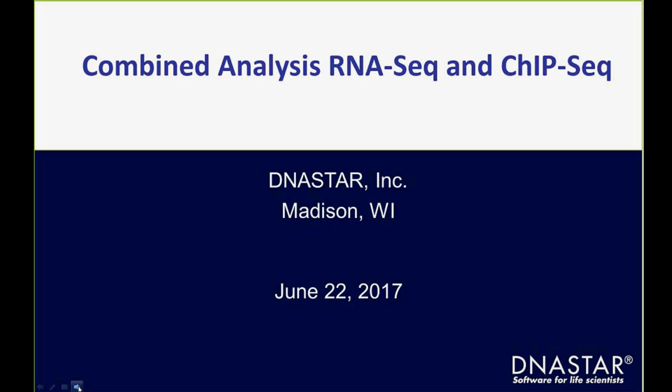Today's webinar will cover a new workflow in our NGS applications, and it's the ability to combine analysis from different data sources into one place so that we can do things like compare gene expression and regulation together and visualize them together. So it's some really exciting new capability in the software.